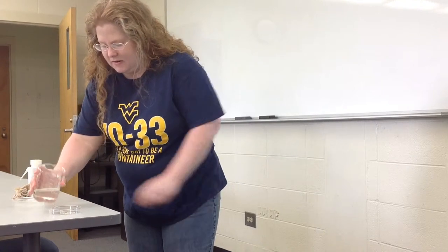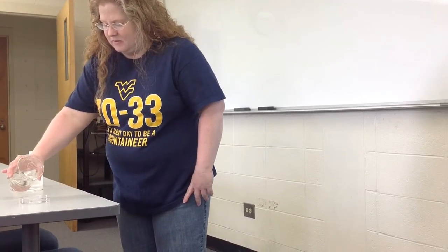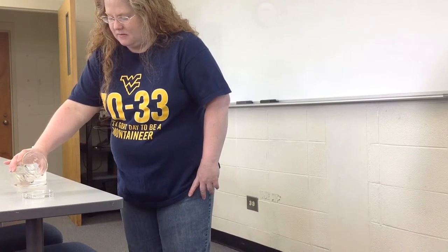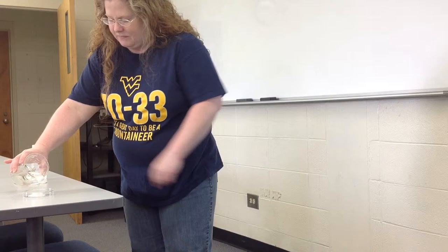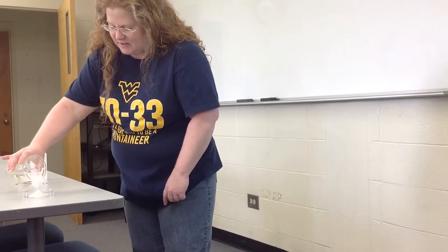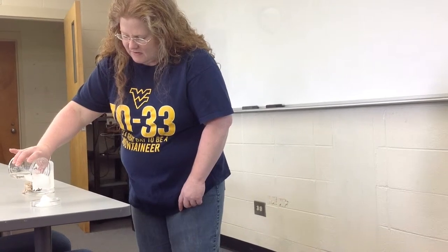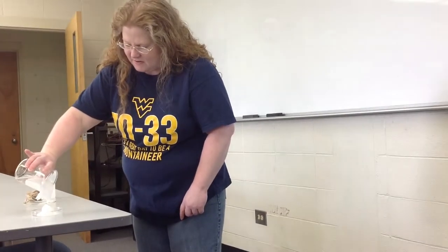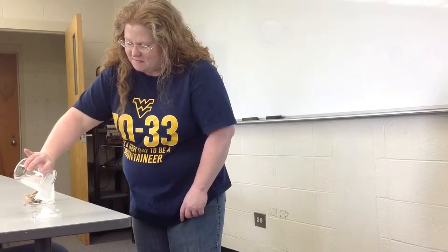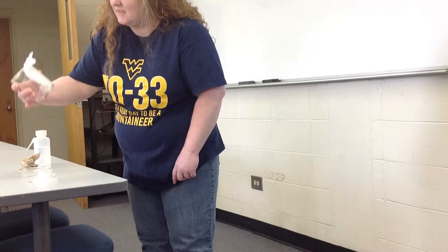I'm going to pour it here onto my dish. Let's see what happens. Oh, there it goes. I'm getting crystallization at the top, but I'm going to keep pouring. My whole beaker has crystallized. That's okay — sometimes it happens. So you can see that.